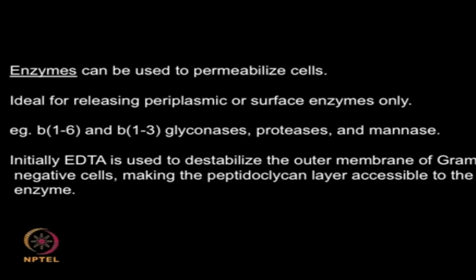You can also use enzymes for permeabilizing cells. It is very good for periplasmic or surface enzymes, like beta 1,6 and beta 1,3 glucanases, proteases, mannases. All these enzymes are very good for that.